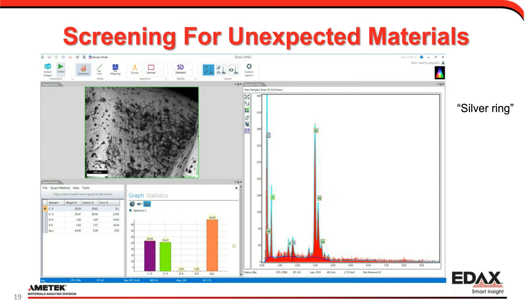But for those of you who are more entry-level users who are using EDS for the first time, looking at the spectrum peak probably isn't doing you a whole lot of good. So what we do in the APEX software is simultaneously in live time report the quantitative results. And you can see here that sure, silver is in fact present in the material. And we even give you graphs that show how much silver quantitatively is present in the material. So we have 44% silver within this field of view, this collection area that we're looking at. And this was done in just a quick collection time.